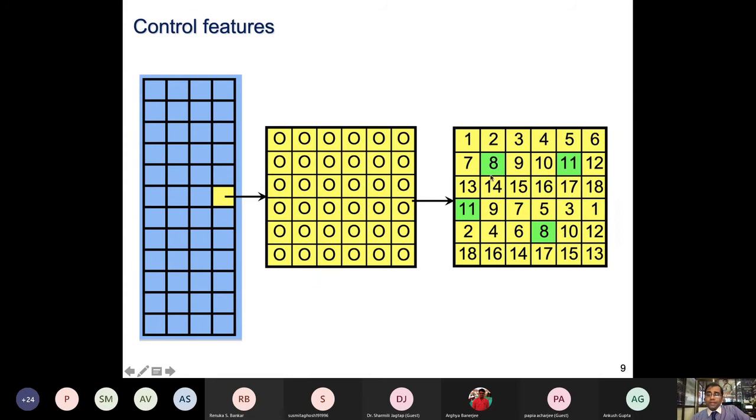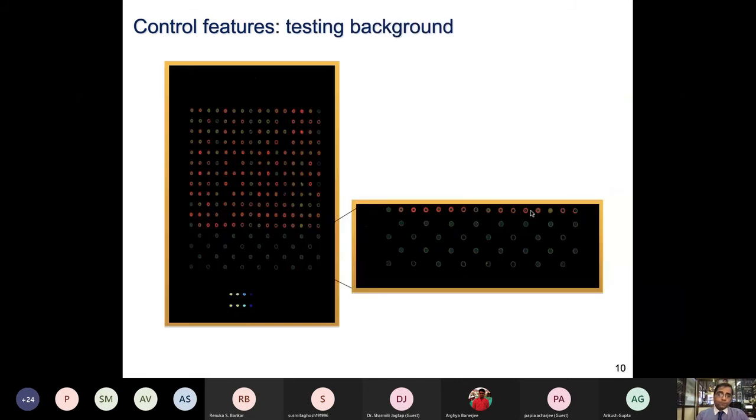You don't want the same proteins, or the DNA, to be printed next to each other, so that you have no neighboring effect. You want duplicates for reproducibility, like one across the corner and another on the corner diagonal. This is something you should keep in mind: your duplicates should not be next to each other.